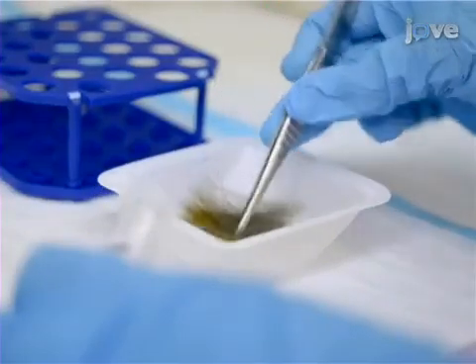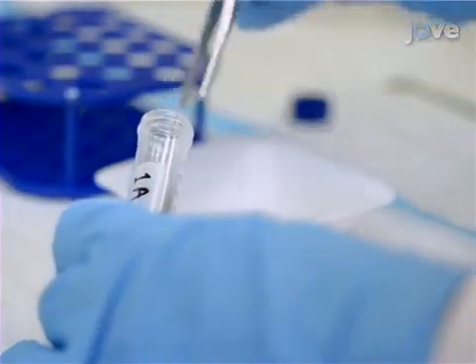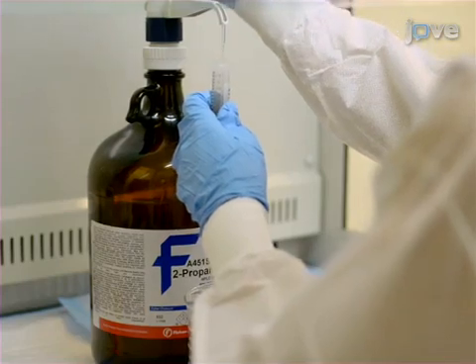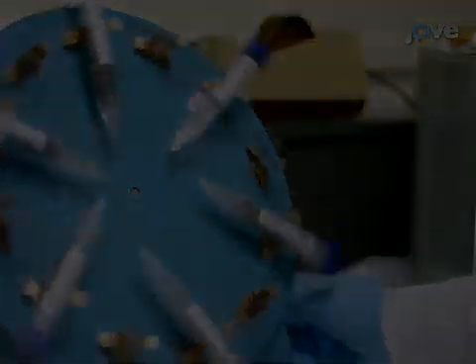Begin by placing each hair sample into individual 15-milliliter screw cap polypropylene centrifuge tubes. Then wash the samples two times in five milliliters of HPLC-grade isopropanol by repeated inversion on a rotator.